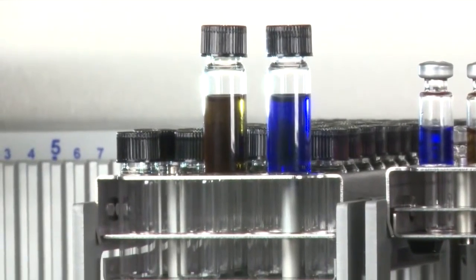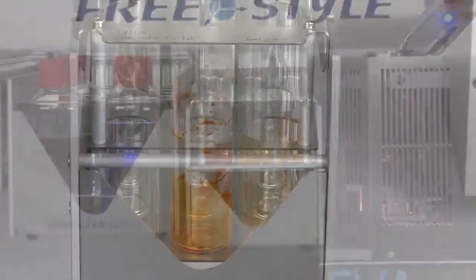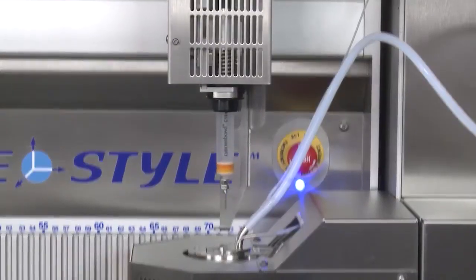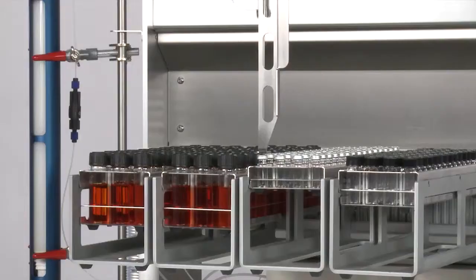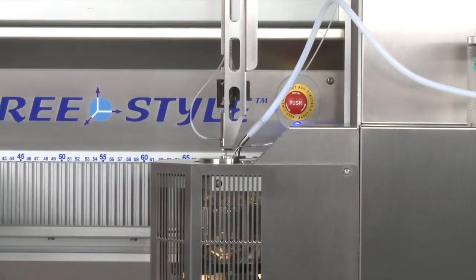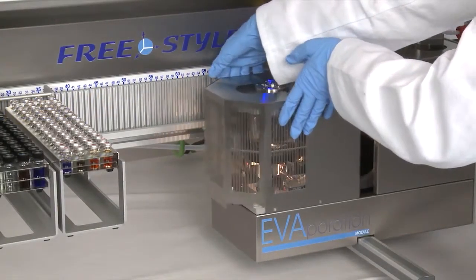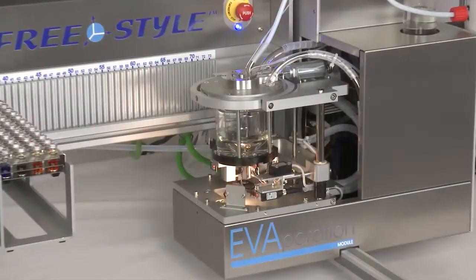It may be used as an automatic evaporator controlling samples with undefined volume, evaporates to a freely selectable target volume, and even rinses the sample container. Or it can be used for the concentration of an eluate from an SPE column, or for the online concentration of a GPC fraction. In the following, we will show you several details that are unique to the system and are incredibly advantageous for you as the user.